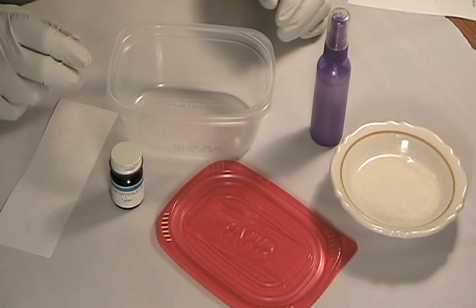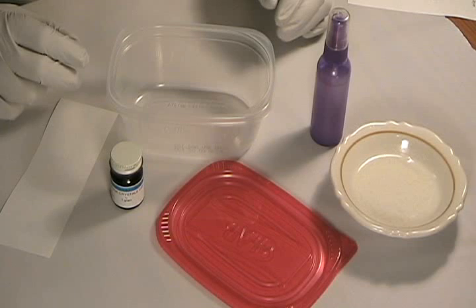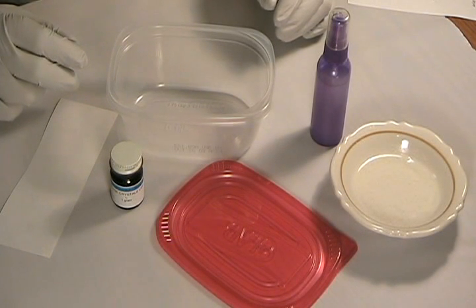Before you begin work, put down old newspapers, plastic sheeting, or something else to protect your work surface, because iodine stains anything it comes into contact with. Choose a container size for your fuming chamber that's appropriate for the size of your specimen. Professional forensic technicians often use a large ziplock bag for a letter-size sheet, for example.